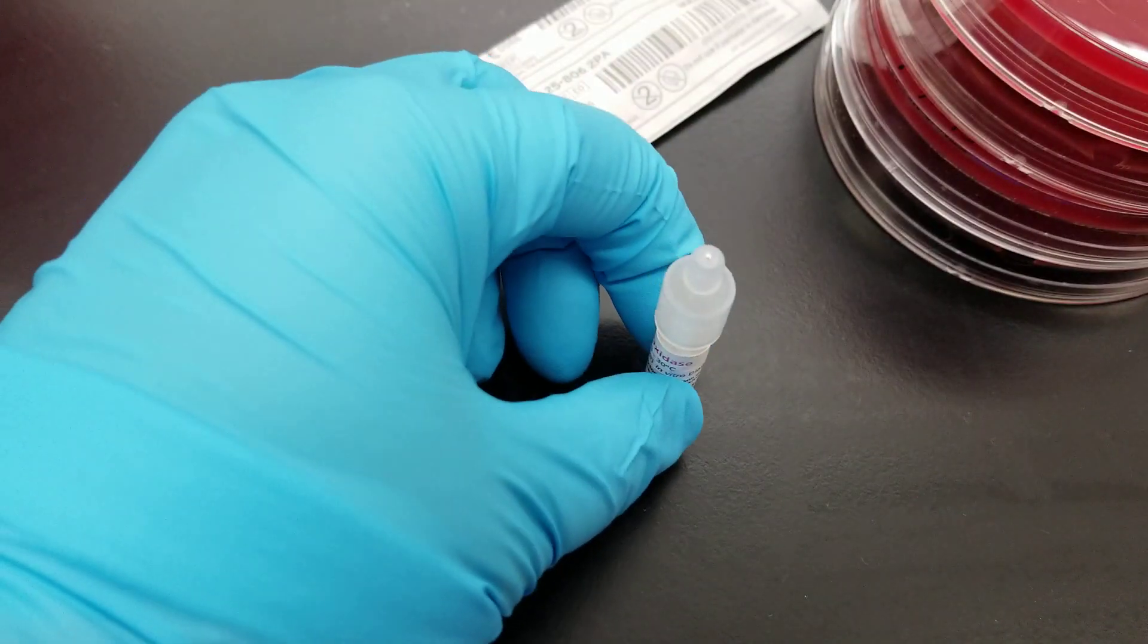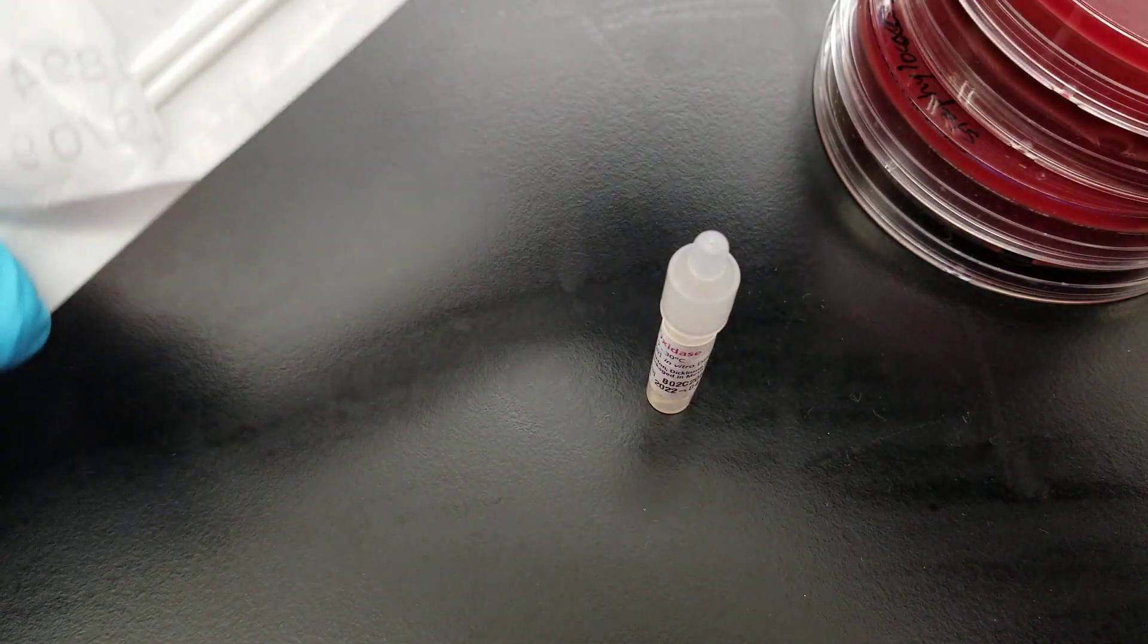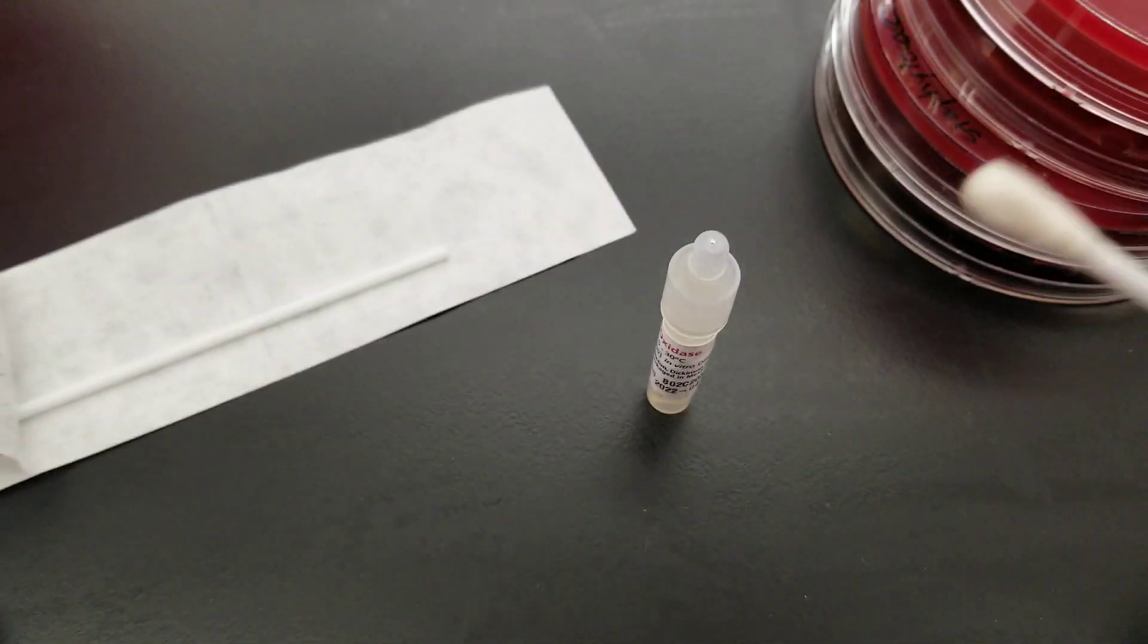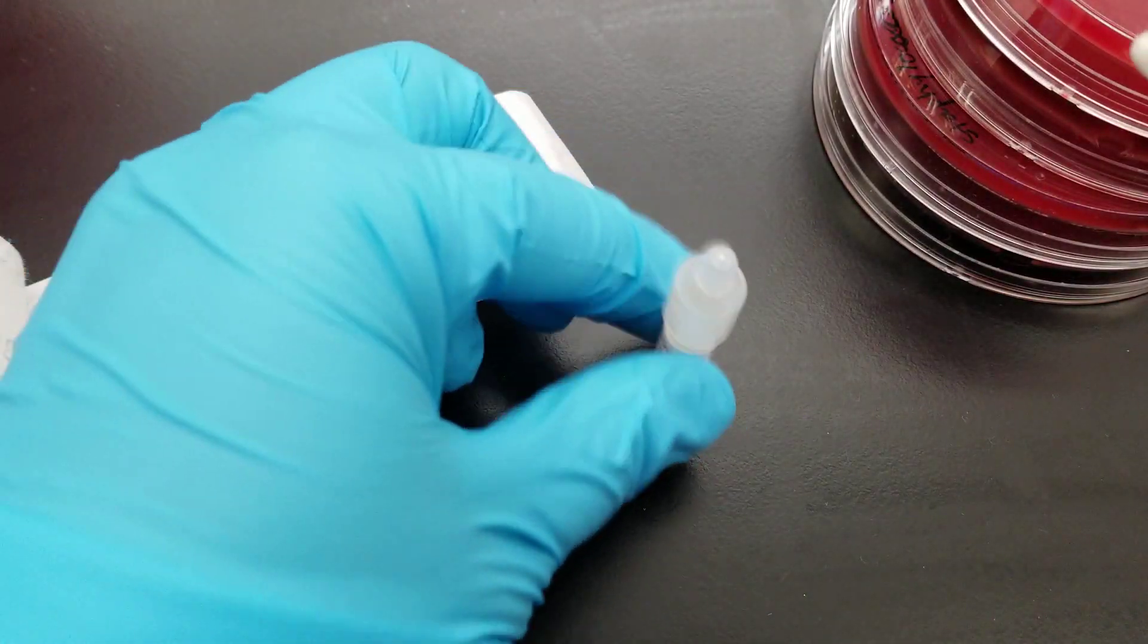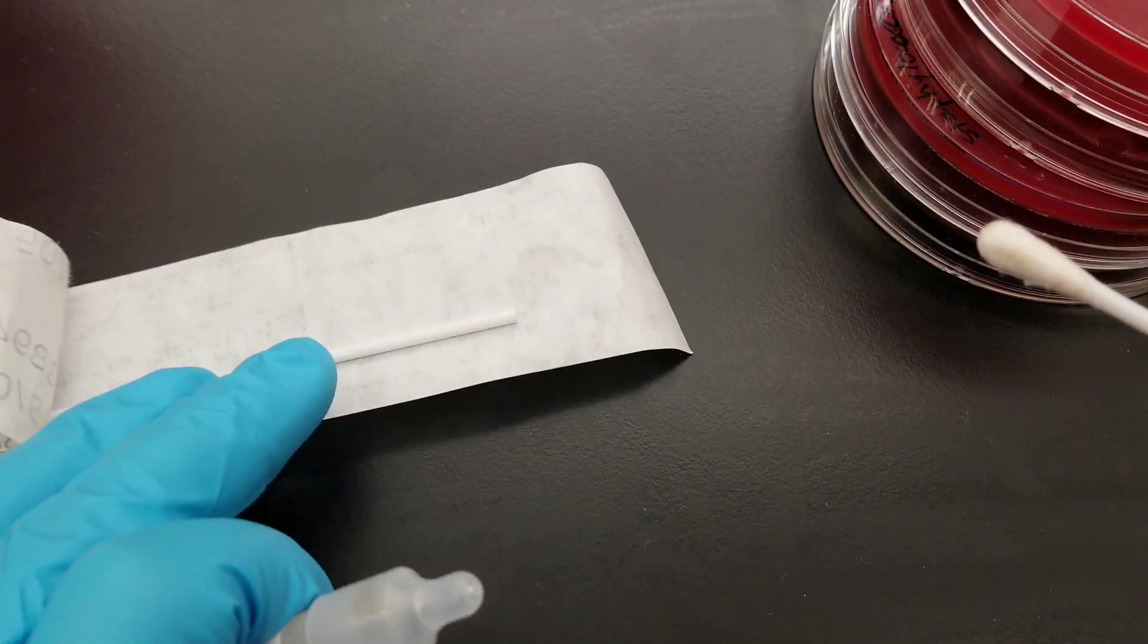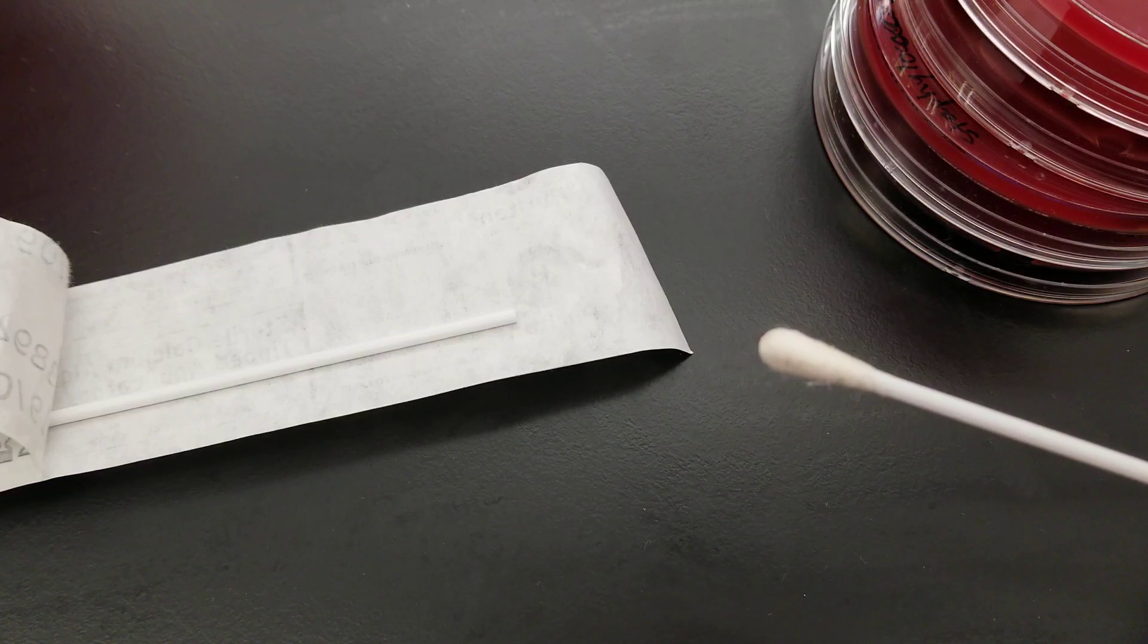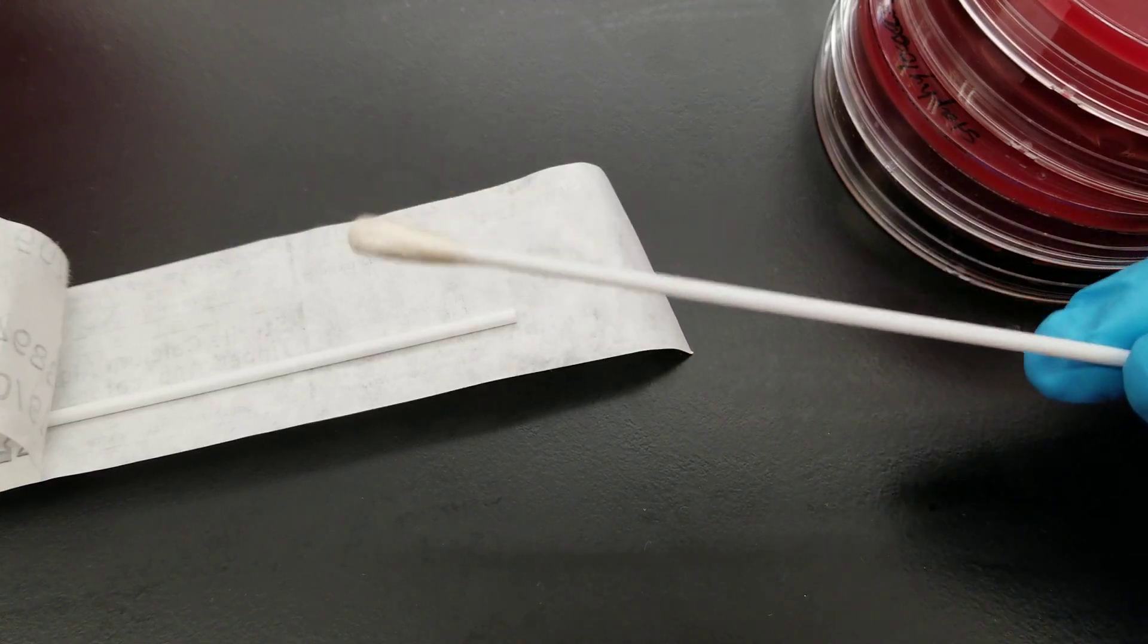We have a sterile swab also right here. There's two within this packet. I'm going to open it up. So the first thing that we do is pick a swab. For our unknown organism, we would pick a colony using the swab. There are different kinds of procedures that you can do with oxidase. You can use a filter paper, you can use a test tube method, or you can use this swab method, which is what we're going to do.